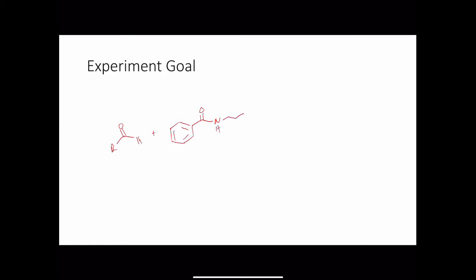So that's what day 1 is going to be about. You're going to be synthesizing this particular compound, okay? And then we're going to be forming this oxazolone, which is right here. And this particular oxazolone is a chromophore type molecule, so it's active under certain wavelengths of light. That's mainly because of all the conjugation there, right? So you have like that phenyl ring and all the unsaturated bonds in that molecule, okay? So we're going to be splitting this into 2 parts, like I said. So this will be day 1, and then day 2 is actually forming the chromophore, okay?